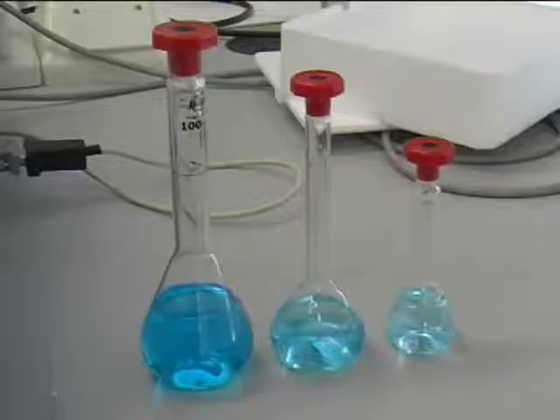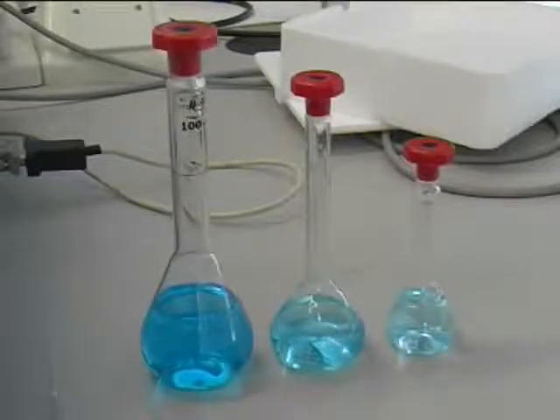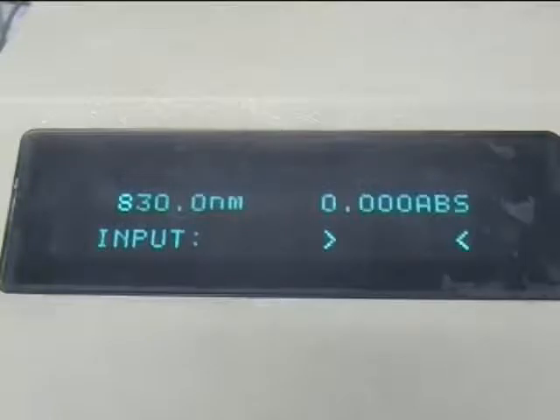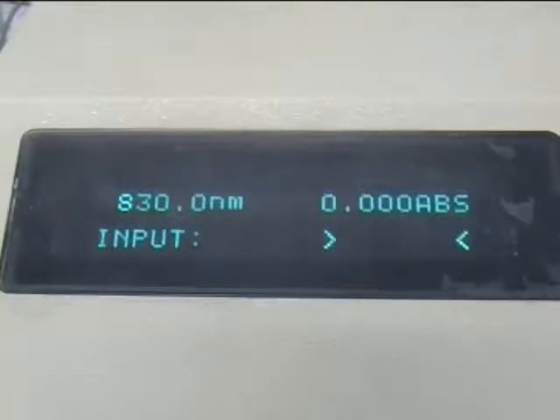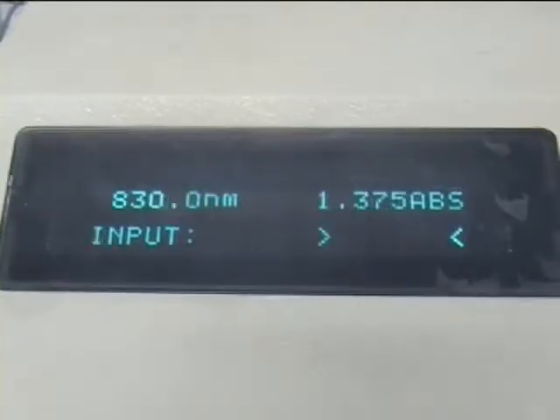You can also carry out UV-Vis without the need for a computer. In this case, the data appears on the screen on the top of the spectrometer. This is known as single beam acquisition.